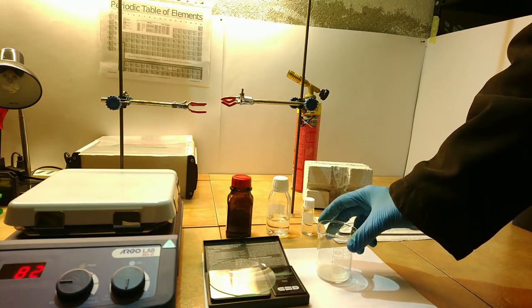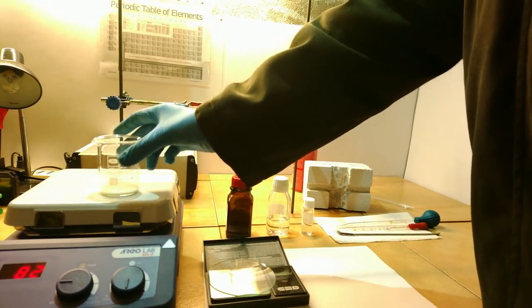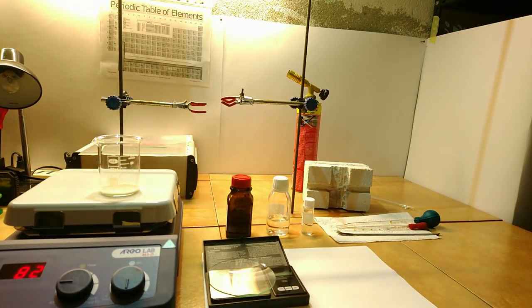After adding everything and stirring, put the beaker on a hot plate at low heat until all the water has evaporated. While the water evaporates, let's talk a bit about the next step. We need to fire the dry powder that we are making in a tube furnace at over 1000 degrees under inert atmosphere.